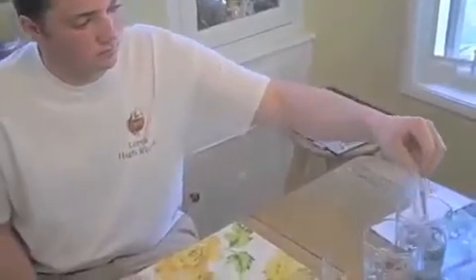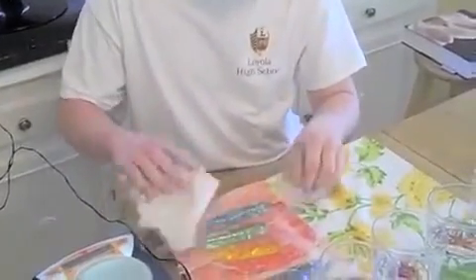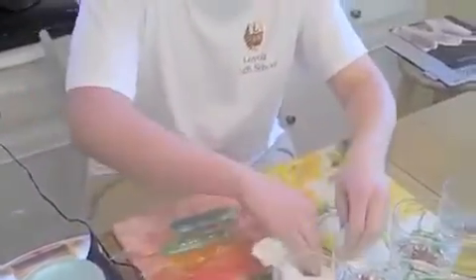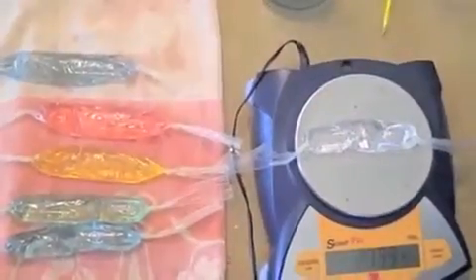After 30 minutes, each bag is removed from the water and placed on a towel. They are then wiped dry again to remove any external water. Finally, the mass of each bag is recorded once again.